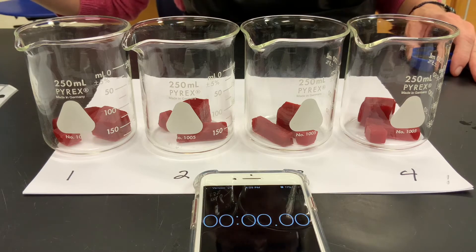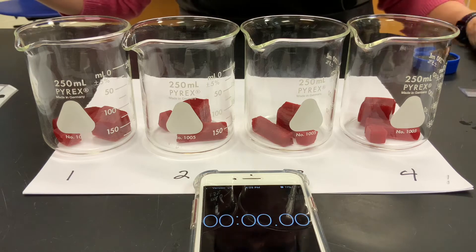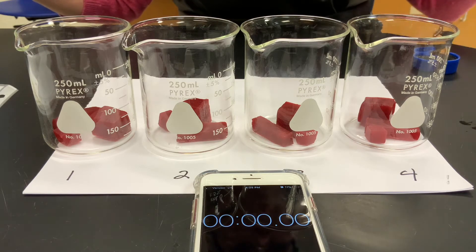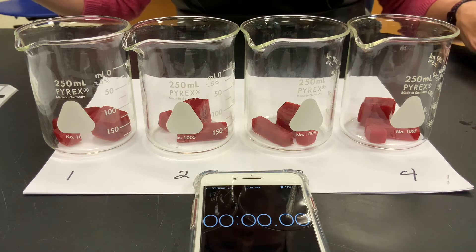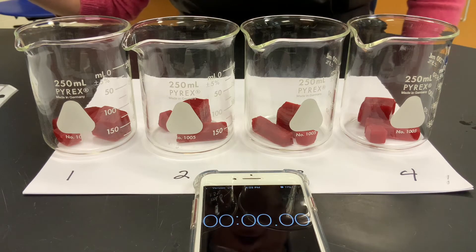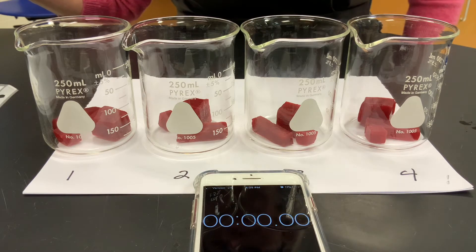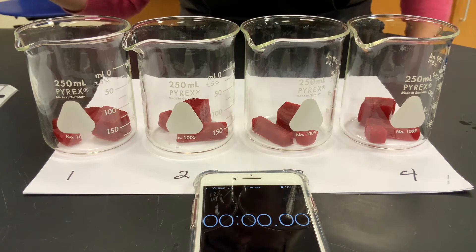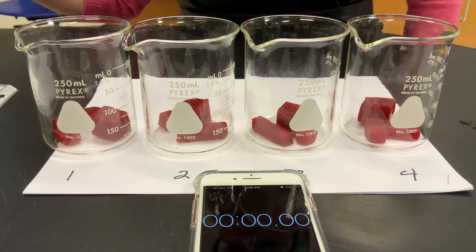This is a lab called Limits to Cell Size. Instead of using agar cubes or actual cells in square shapes, we are using beets and covering them with bleach. The red color of the beets is going to be neutralized and turned white, and the bleach is going to diffuse into the cells, so you'll be able to see them changing color as that happens.